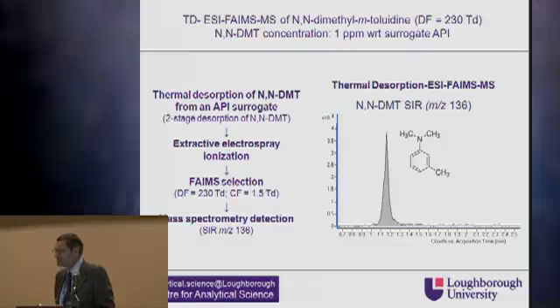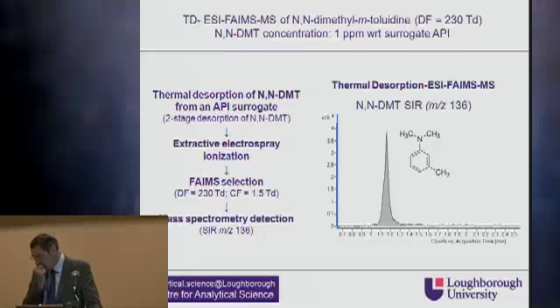Do you ever observe the 3+ charge state? The reason I'm asking is that recent papers, David Clemmer has published one with high resolution of 3 or 4 major conformations and 2 really minor ones. I'm just wondering about the distribution you see across 3 charge states.